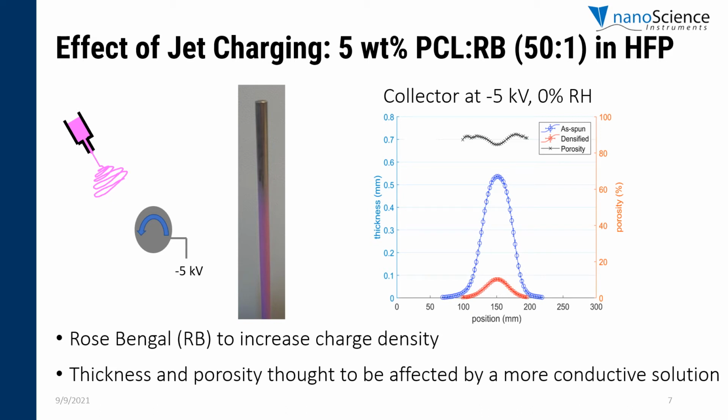Densification has a similar behavior, and the porosity is similar to the sample with only PCL. Meanwhile, one thing that we notice is a small dip in porosity in the central area, which we are attributing to possible solvent retention in that specific location.